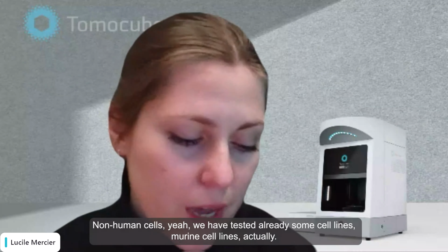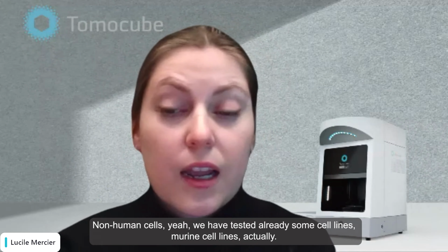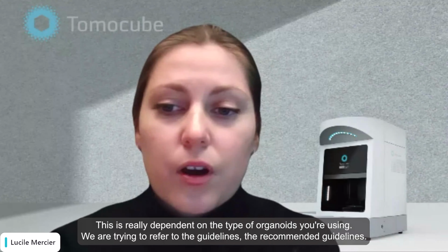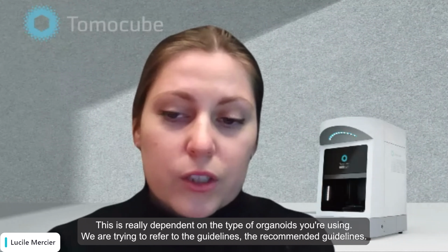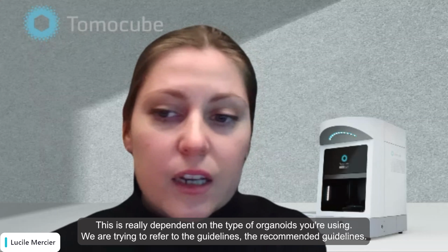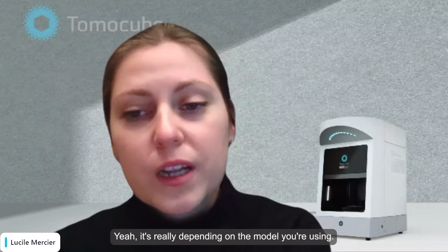Yeah, we have tested already some cell lines, murine cell lines, actually. Okay. And the medium, what kind of medium are you using? So this is really dependent on the type of organoids you're using. We are trying to refer to the guidelines, the recommended guidelines. So yeah, it's really depending on the model you're using.